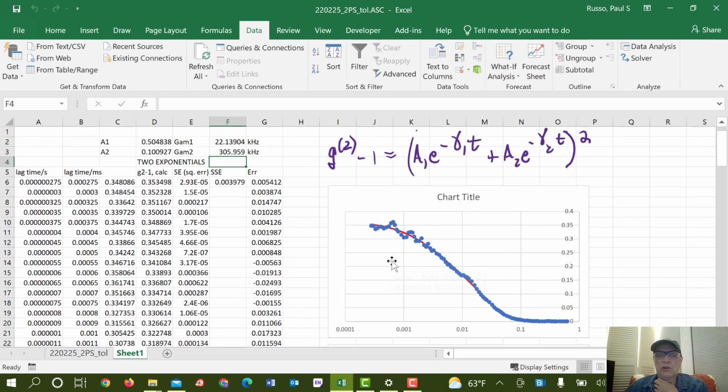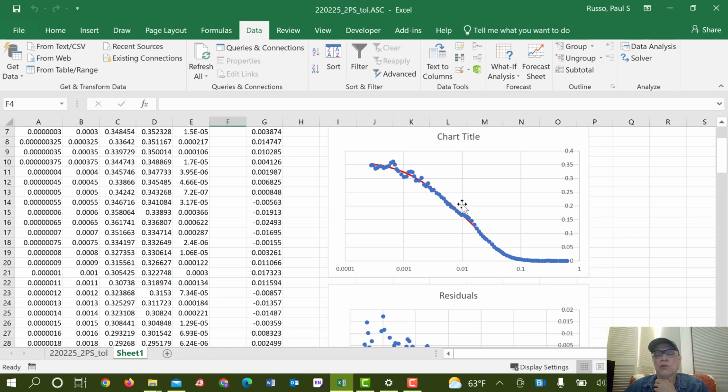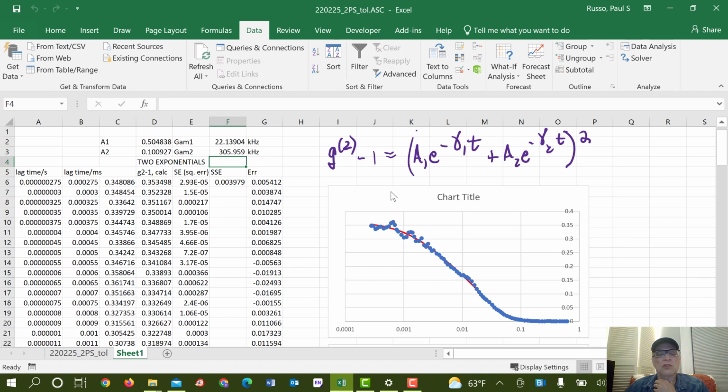So what have we learned? We've learned that Excel is really sensitive and doesn't do well with the numbers at the low end of the range. And the fit is doing okay. You see this little shallow depression down here. That corresponds to the issue there with this lump that we have, which is an electrical problem or a mechanical problem. But otherwise, it's pretty much nailing that baby.